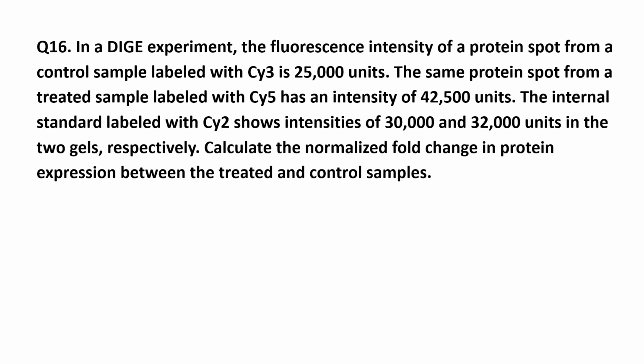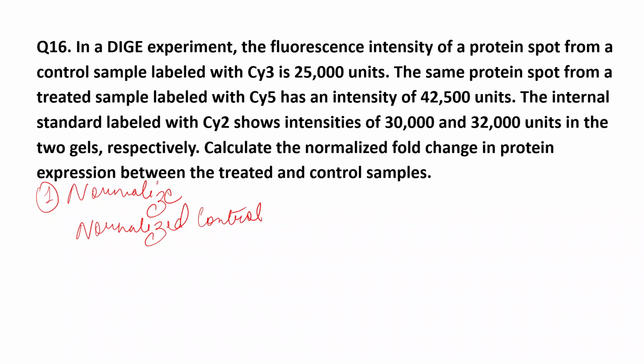The first step is to normalize. You have to first normalize each to their internal standard. So normalized control equals control divided by internal standard.